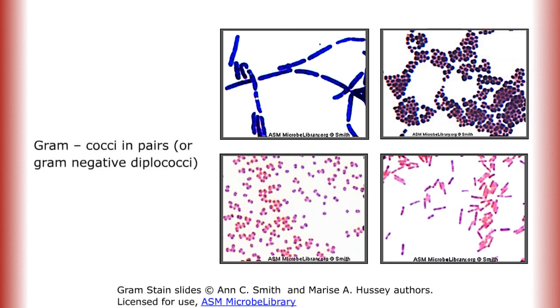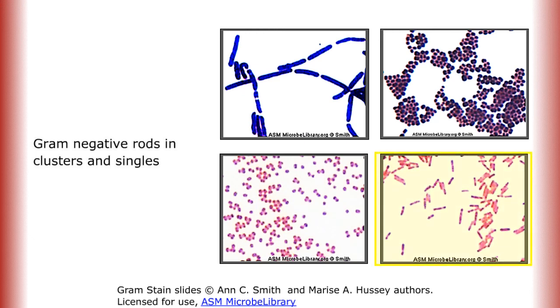Gram-negative cocci in pairs. Gram-negative rods in clusters and singles. Gram-positive rods in chains.